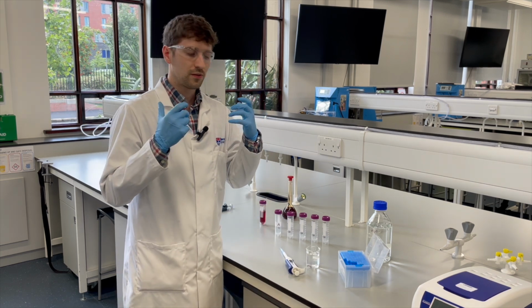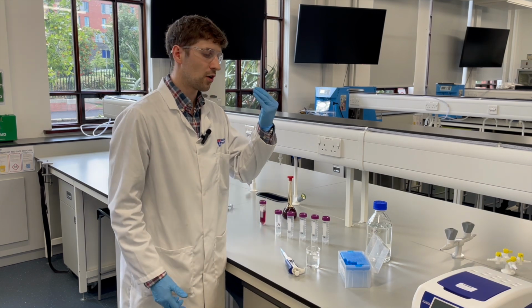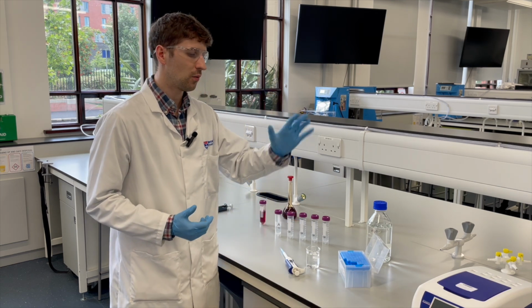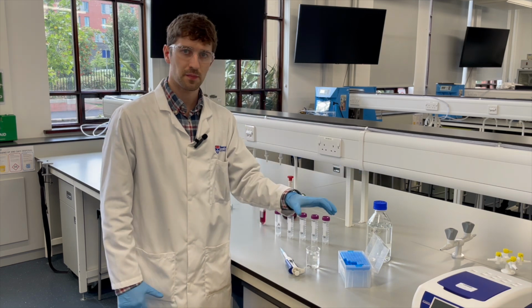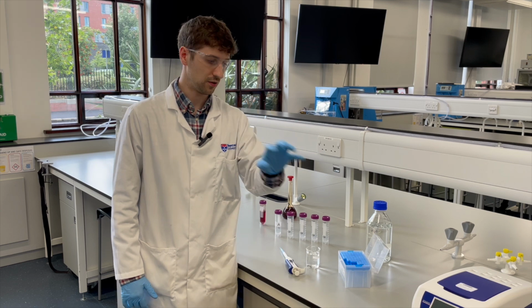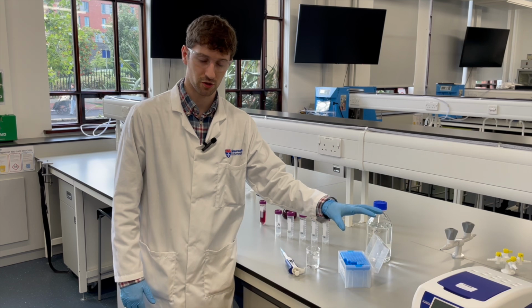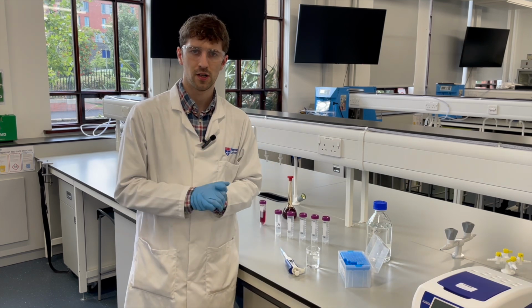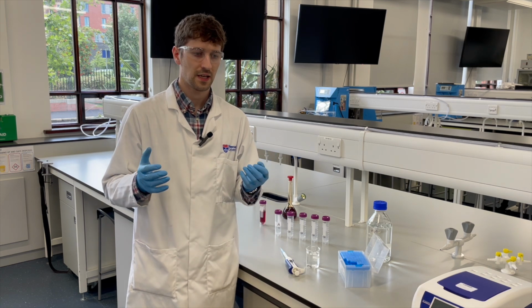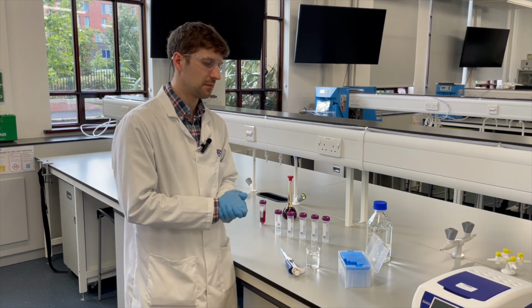Now, the most important thing that we need to know before we construct our calibration curve is what is the volume that we need, okay? Now, what do I mean by that? Well, for example, our UV spectrometer needs 4 mils, right? We need 4 mils to measure absorbance in our UV spectrometer because of our large cuvettes, okay? So 4 mils. 4 mils basically allows you to fill the cuvette and have a wee bit left over, just in case you make any mistakes, all right?